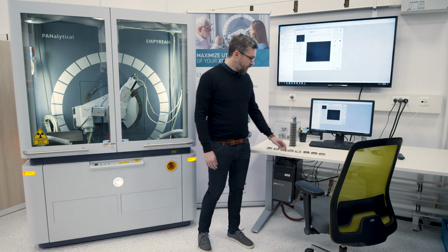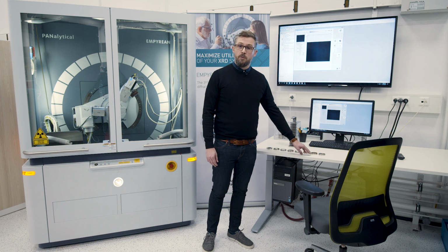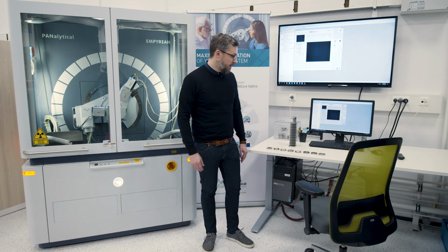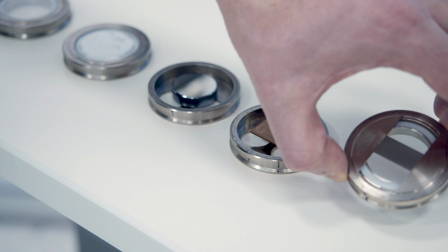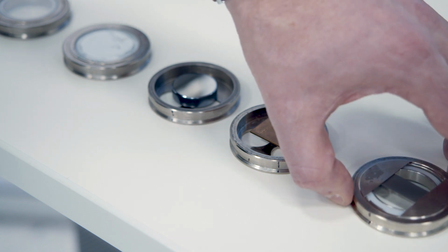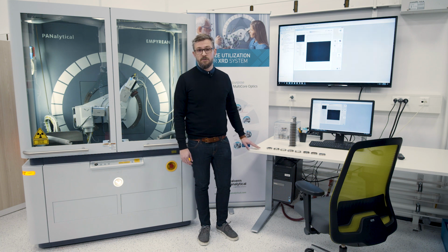Then afterwards, we will be measuring rolled copper, on which we will perform omega texture measurements, which is a completely new functionality that has been added to our Empyrean. Then we will be conducting omega stress measurements on a steel transmission from a car. And all of that will be measured in a sequence without me interacting with the system.